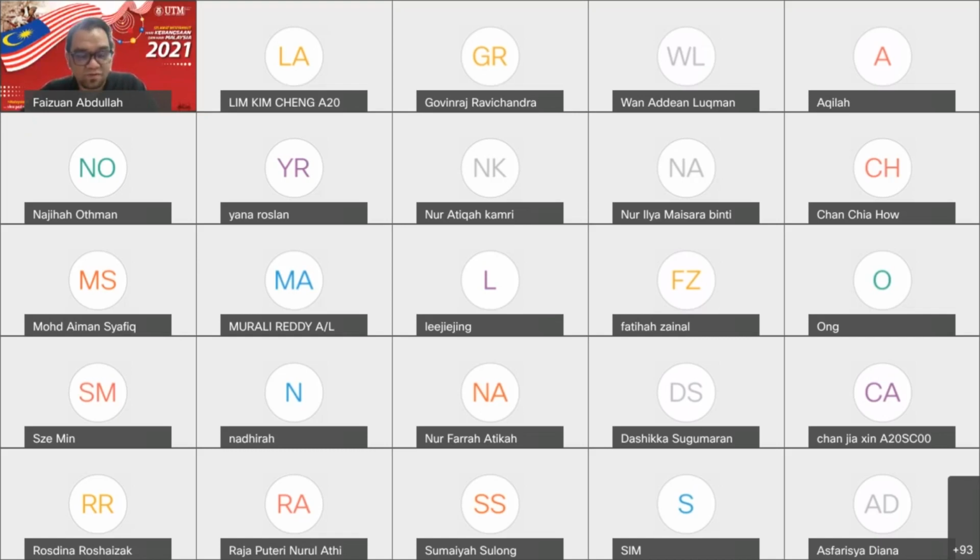Okay, what is matrix? We have various types of sample matrix. For example, we have a river water sample. Our analyte is zinc, but the matrix, the other substances and compounds inside the sample, may interfere. They can disturb our reading process, our analytical process to detect the analyte.